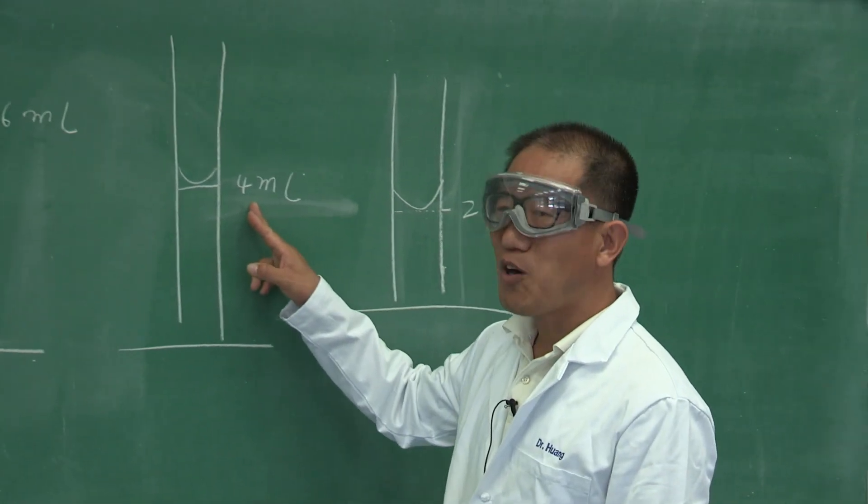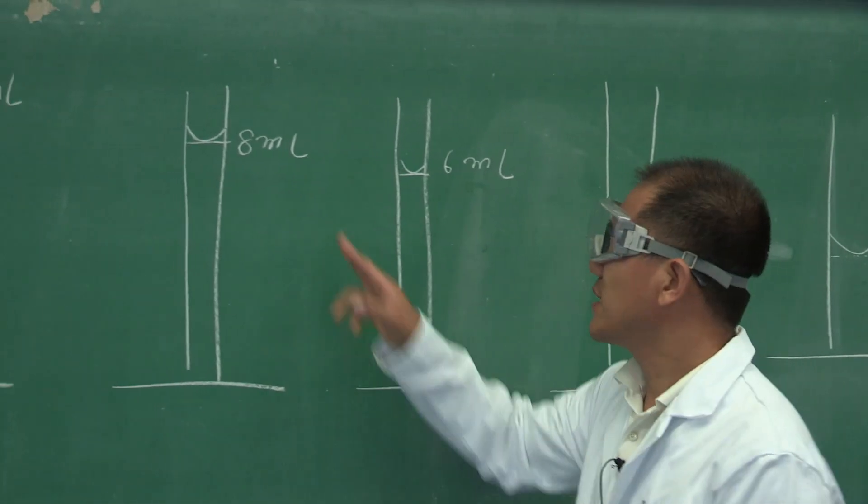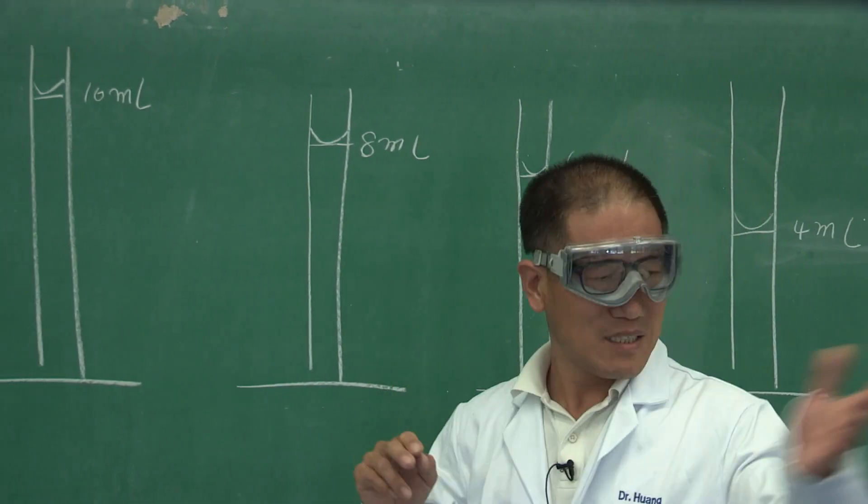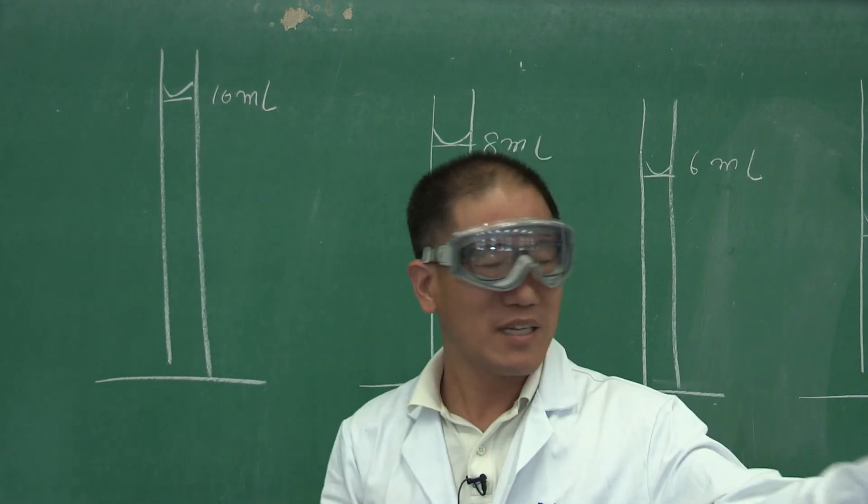Add to 4 milliliter mark, get the mass. 6 milliliter mark, get the mass. 8 milliliter. And then, get the mass. Finally, 10 milliliter mark, get the mass.